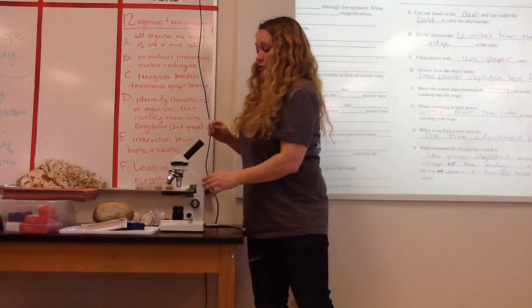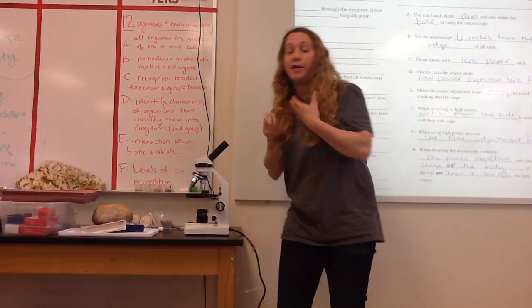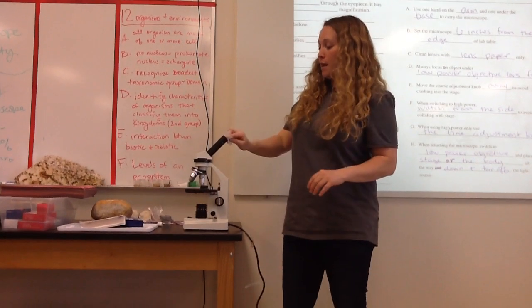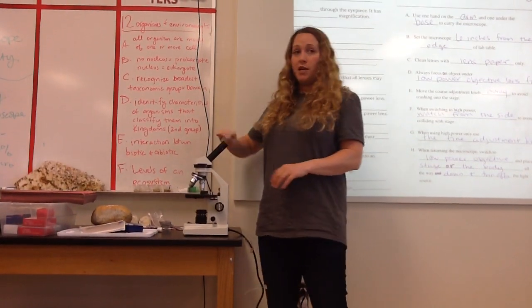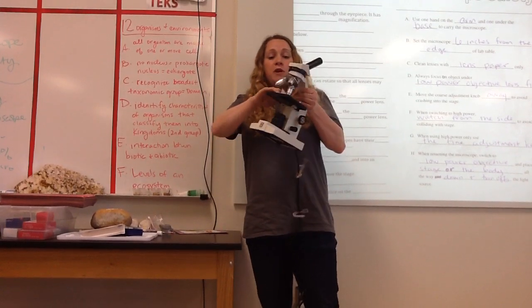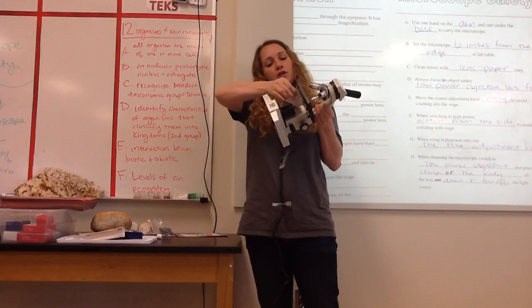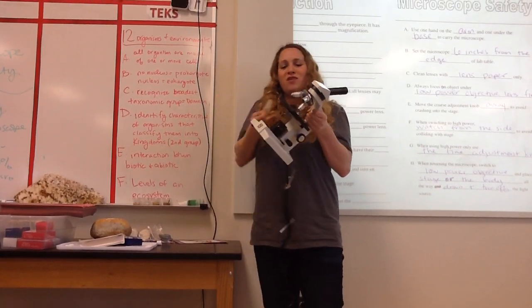Don't let your finger touch it, though, because your fingerprints will also stay on the glass, and then when you look through, you'll see fingerprints magnified. So take it, rub it on the part you're cleaning. Could be here on the eyepiece. Could be on the objective lens tip. It could be on the glass on the stage. And it usually wouldn't be, but it could be underneath as well. Okay? Nobody usually touches down there.